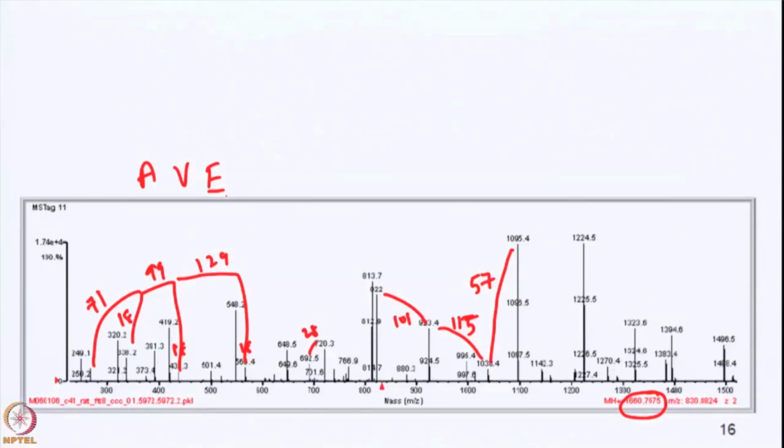This is a tryptic peptide, so it's arginine or lysine.